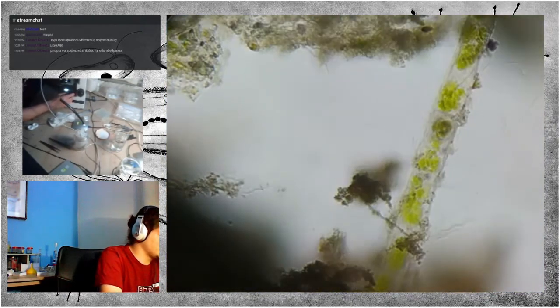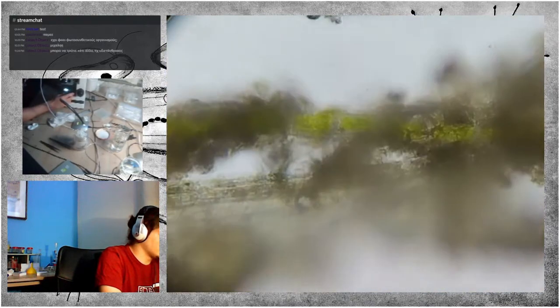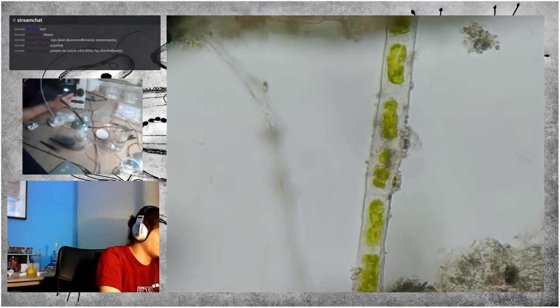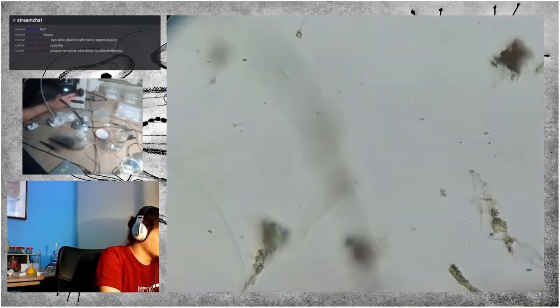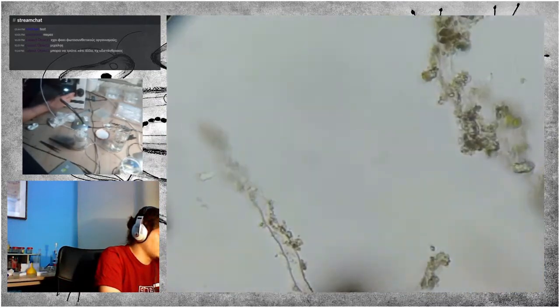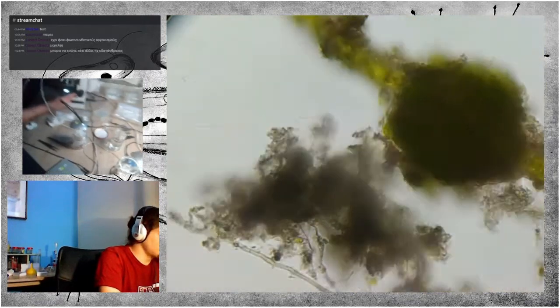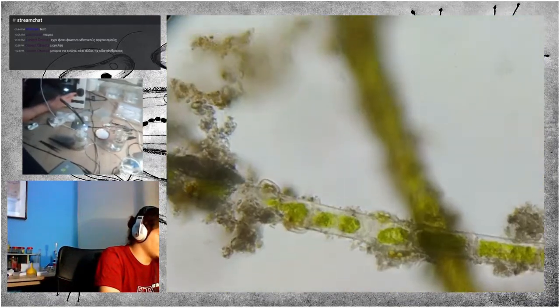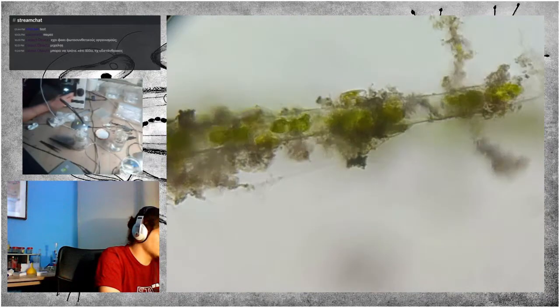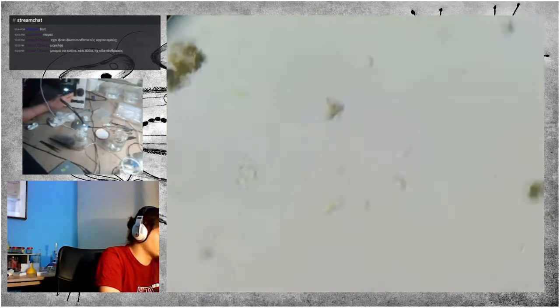And they are sessile, firstly, and so they're very easy to observe and document. I intend to make a series of videos about them, all about Vorticella. But for now, I would like to have a bit more footage to show.